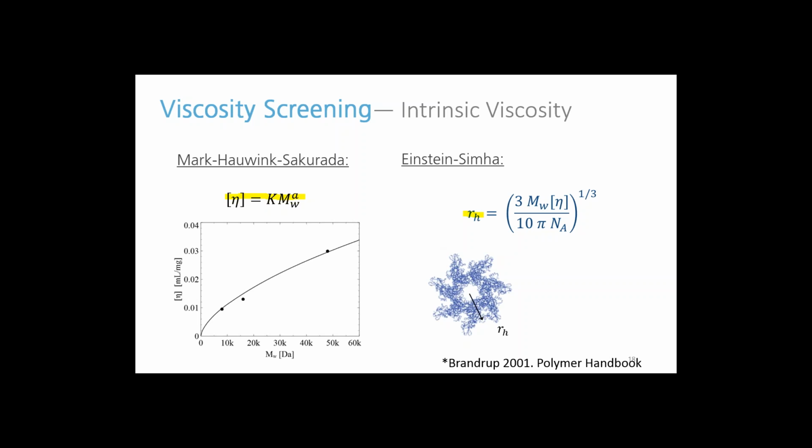As a result, intrinsic viscosity can be used as a complementary technique to DLS to determine molecular size, with two key advantages. One is that as we are measuring a bulk property, it's not so sensitive to local impurities. And the second one is that we are not limited by the bulk viscosity, and we don't need to dilute some of our formulations.